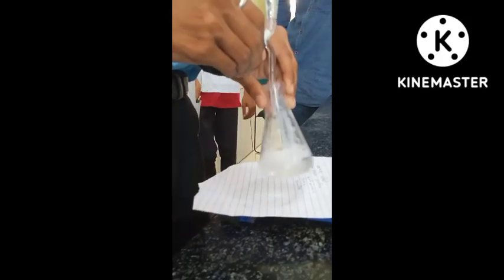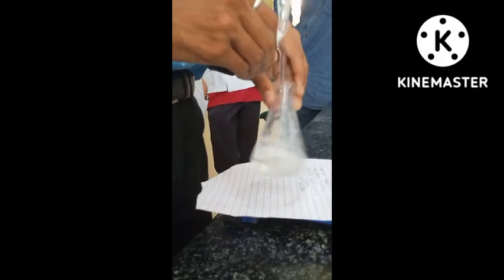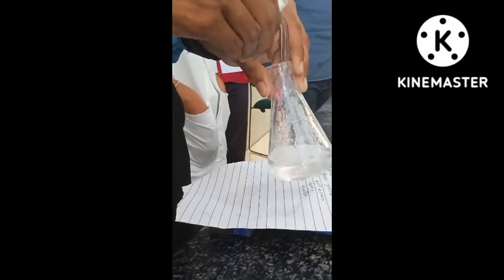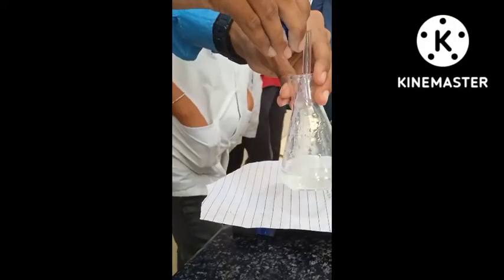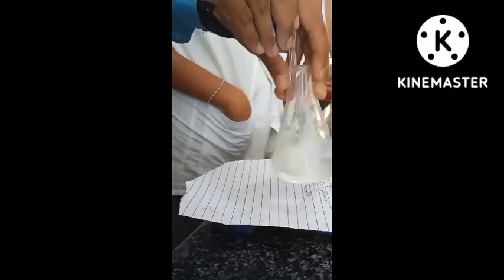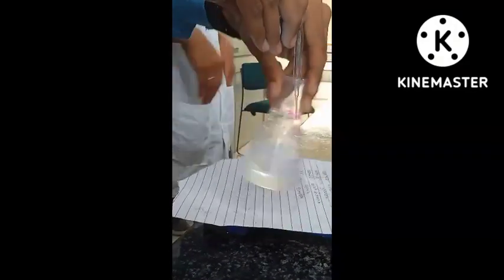We are adding NaOH drop by drop. After a little while, this pink color will come by adding NaOH. You can see some lines of pink color there. Like this is a titration we are performing, in which at the equivalent point the pink color of the indicator will come, slowly and gradually. We have to add NaOH drop by drop, slowly.